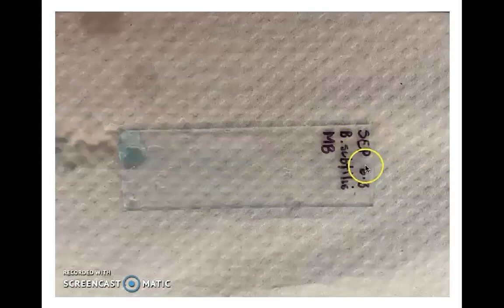So I have my initials, I have the date that the slide was made, I have the name of the organism that's growing in my culture, and that is capital B for the genus Bacillus, and the species name is subtilis. And then finally, I wrote MB on this slide because I'm going to be using methylene blue as my stain.